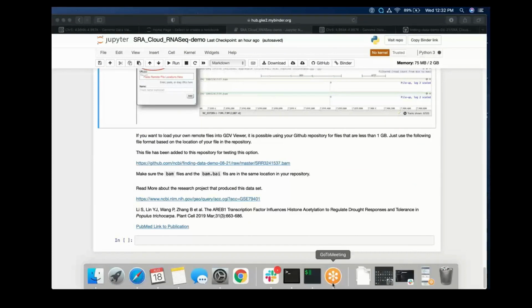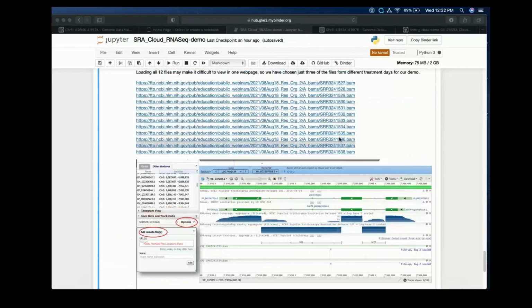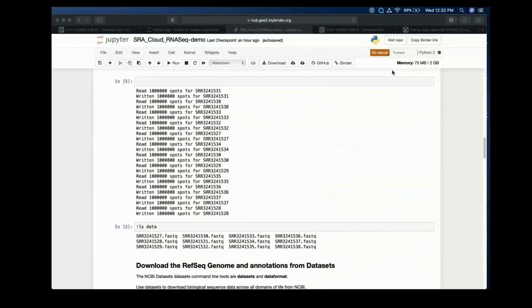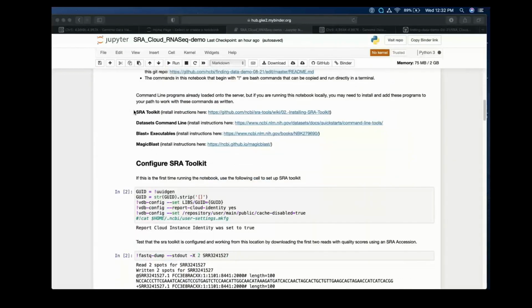So don't hand it over to me yet, because there's a question that I think is best answered by just showing them in the notebook. So one question was, what's all the software that you needed? And so I think you made a list of that at the top of the notebook, right? So on what your requirements were for that. So if you could just explain that to them. I put it here with the install instructions linked.